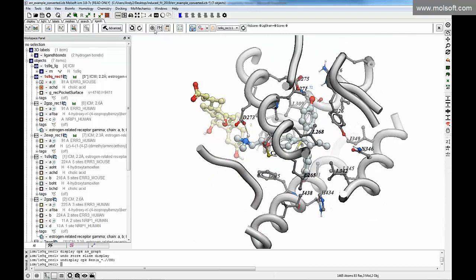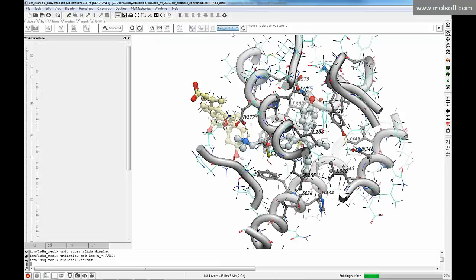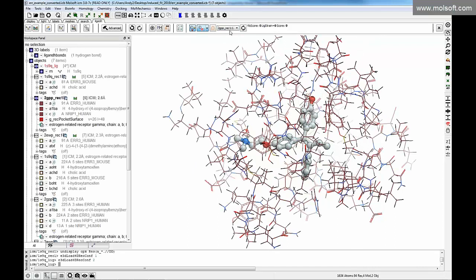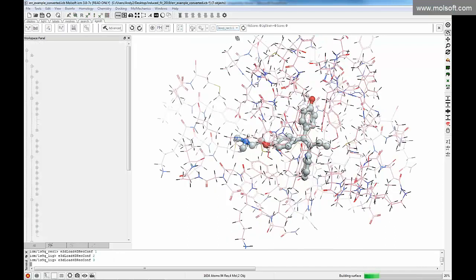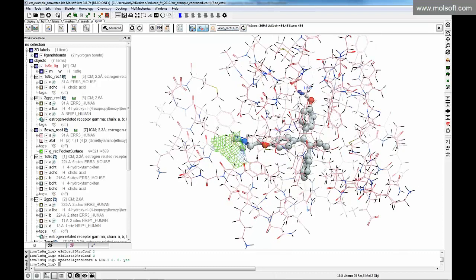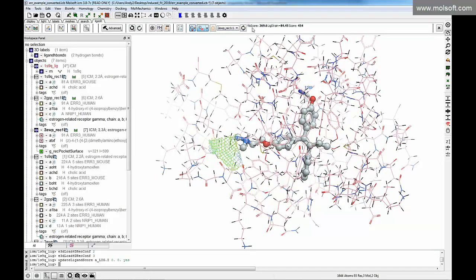So basically in the ligand editor now we have multiple conformations. We have this little tab where you can toggle through each conformation, and you can see the docking score for each one. So this ligand is seriously not happy in this structure. It's got a very high VLS score.